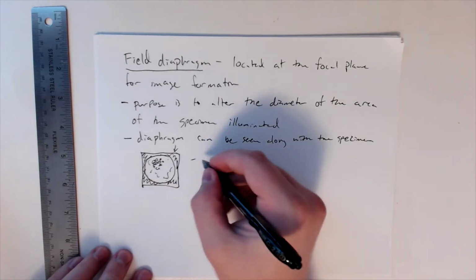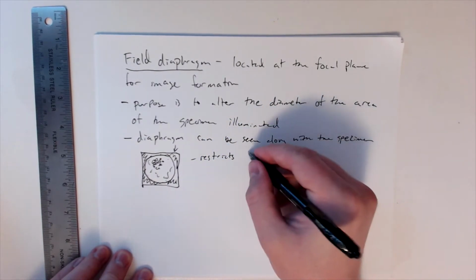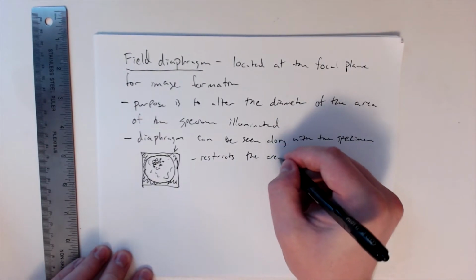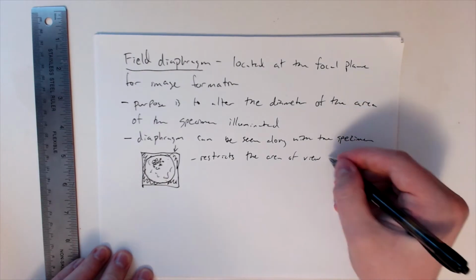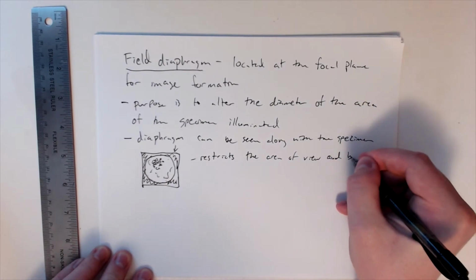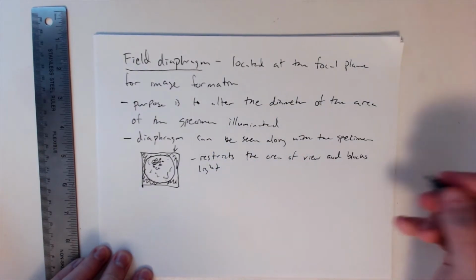So it restricts the area of view and blocks scattering light.